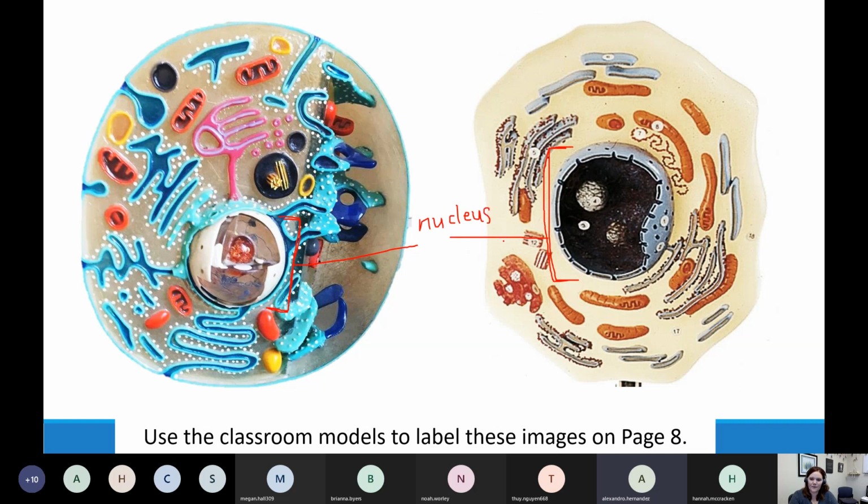The nucleus. Inside of the nucleus, there's something we didn't talk about in lecture, but we do need to know it for lab. So this little marble you see in the middle here, this little white spot that we see in the middle here, this is something called the nucleolus. Nucleolus. Sorry, that looks so terrible. The nucleolus is like a nucleus inside the nucleus, the nucleolus.